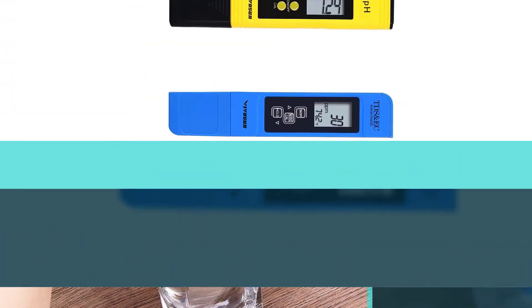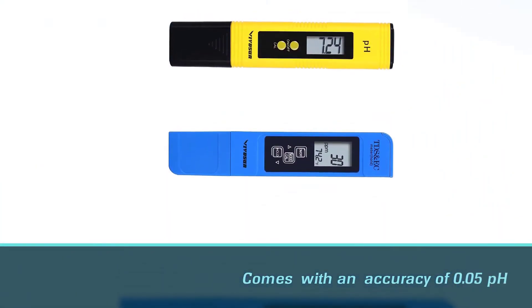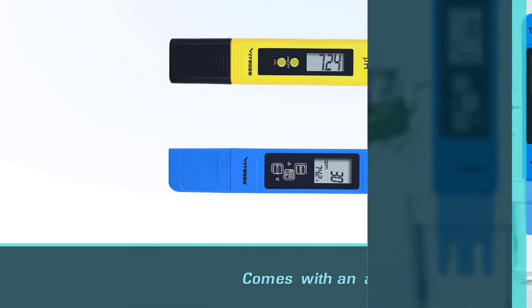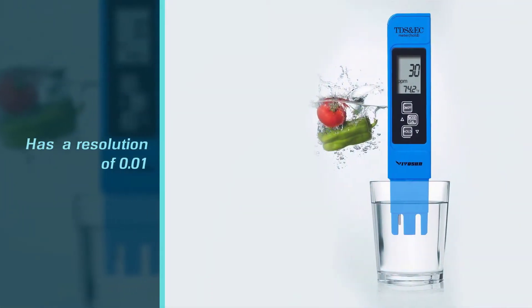The TDS meter measures conductivity, total dissolved solids (TDS), and temperature. The nine-minute auto shut-off feature successfully conserves the battery of the Vivison pH and TDS meter combo.